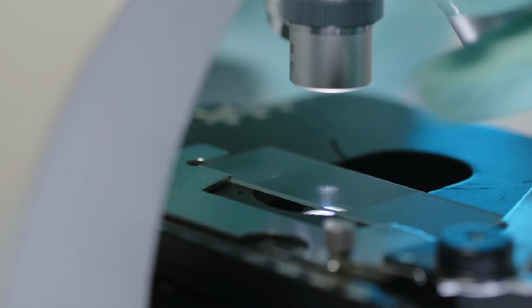So even though you may hear that our slides are dirty, we absolutely don't have dirty slides. We absolutely are not looking at things on the slides that we think is a dirty slide. I hope these 5 things will help you understand what we do a little better.